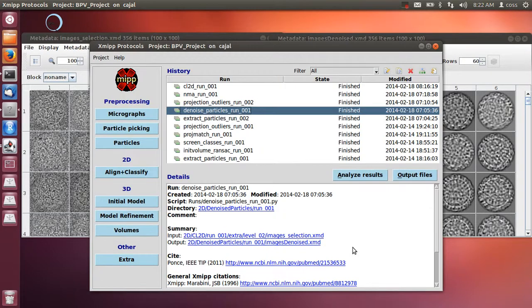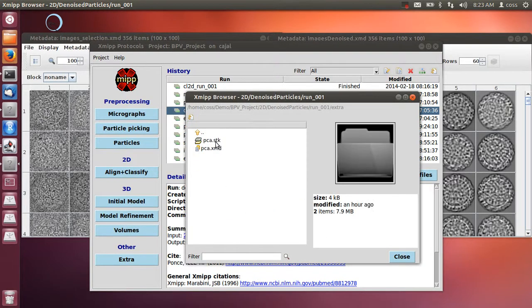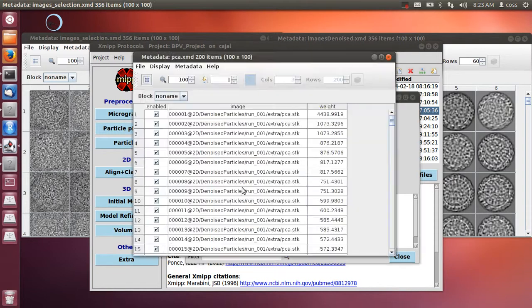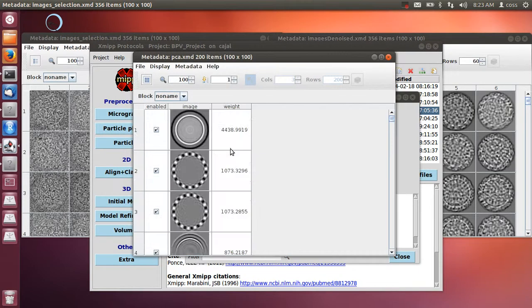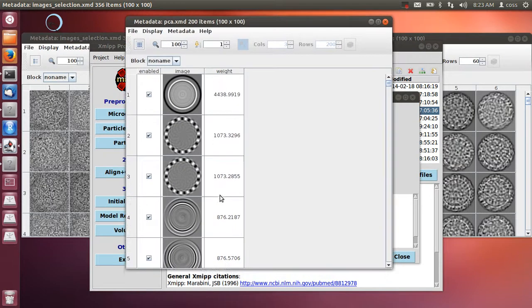So what is the basis? So the basis is rotational. It is in here. So the basis is this one. It is a rotational invariant basis, so that what it does, it takes all the images in your classes.